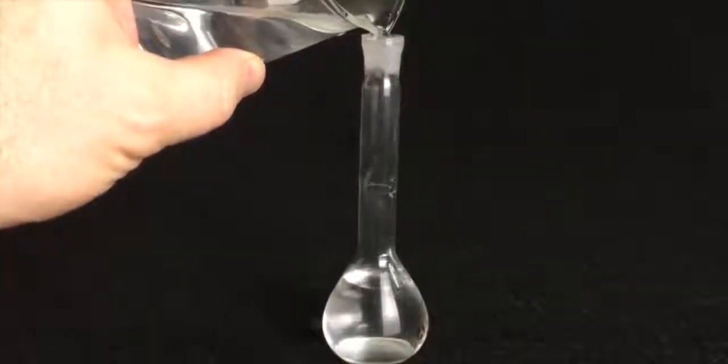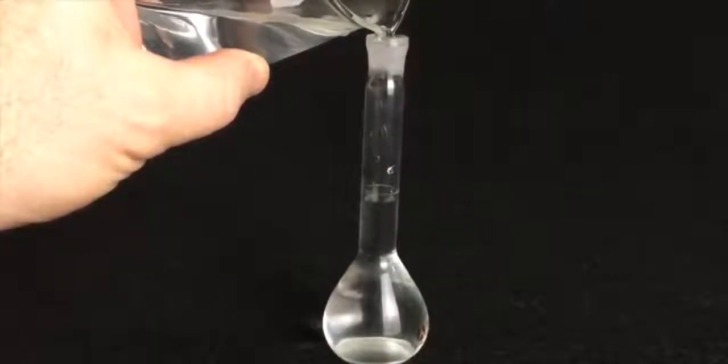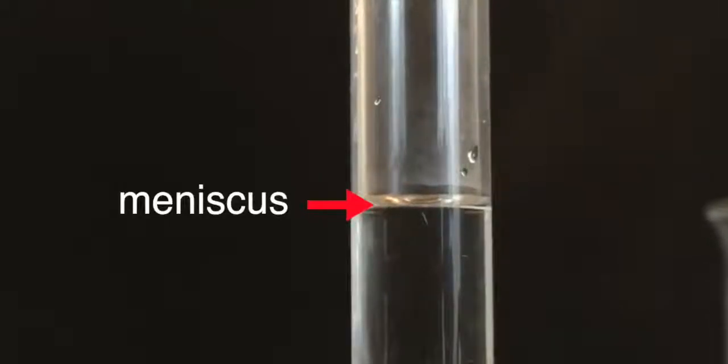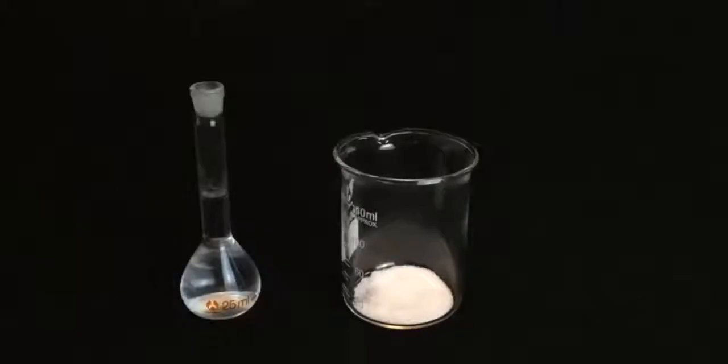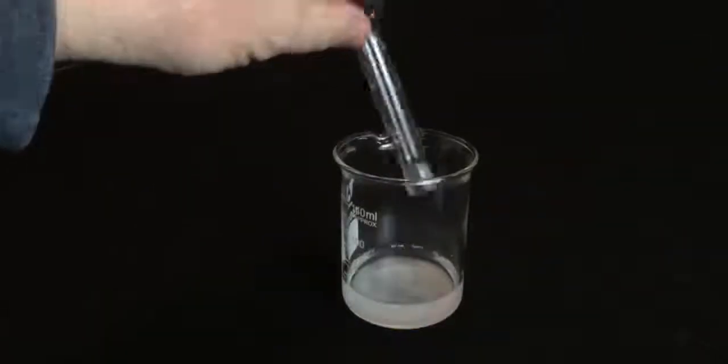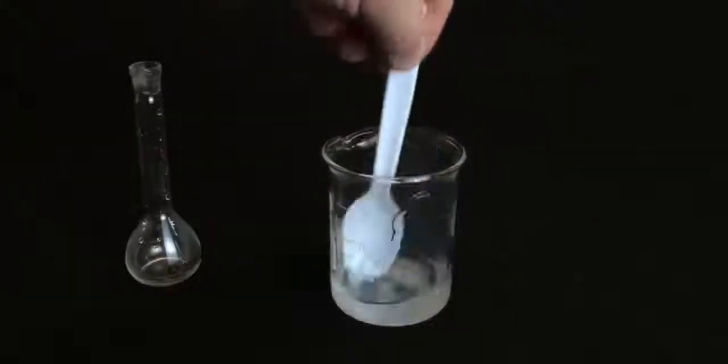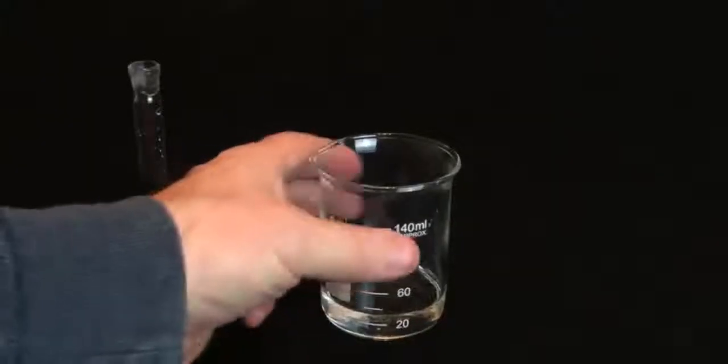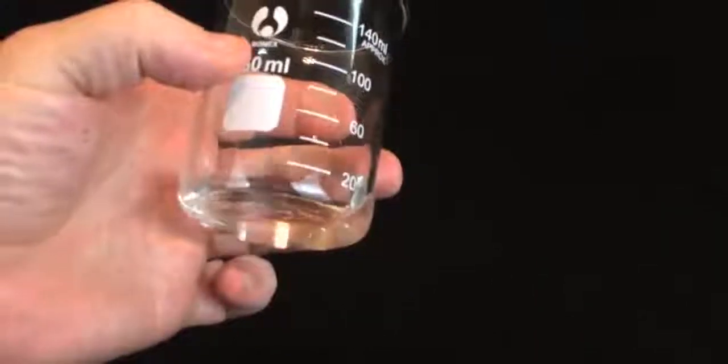Next, we fill the volumetric flask with distilled water until the bottom of the meniscus, that little dip that you see in the top of the column right here, until that is exactly level with the line. Then I dump that in with the sugar, stir it thoroughly until everything dissolves, and voila, our 0.10 gram per milliliter sucrose solution. Easy.